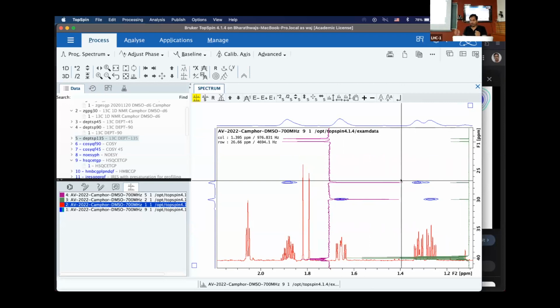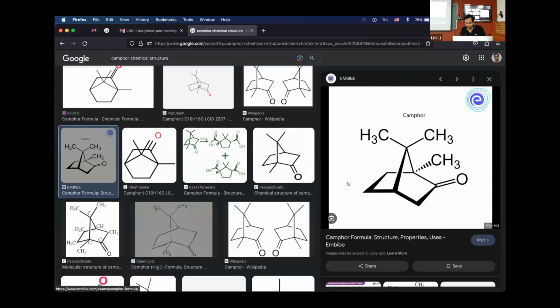And slowly you're able to appreciate how far these 2 protons come up. These 2 are exactly, for instance, you can imagine this to be this proton that we are trying to look at. They're bonded to the same one, very close in space, but you see how sensitive chemical shifts are. Maybe one is facing the methyl groups, the other is facing away from the methyl groups.